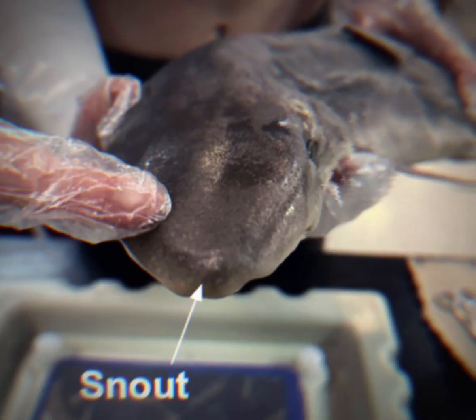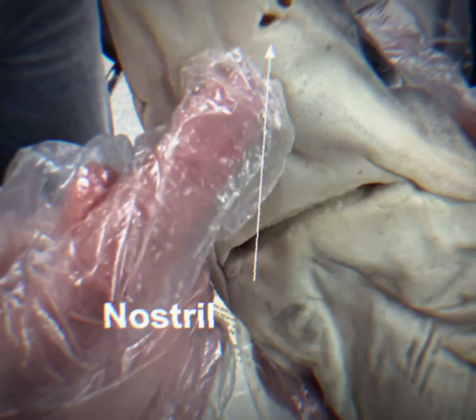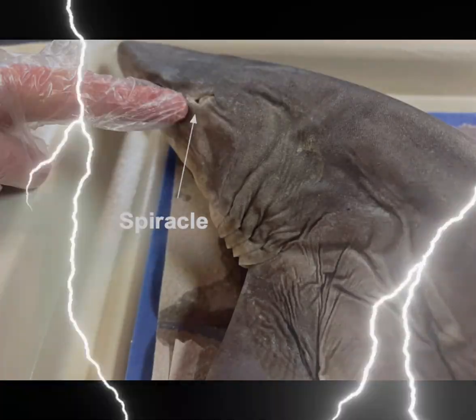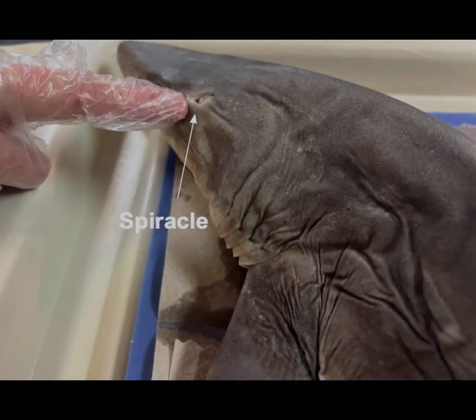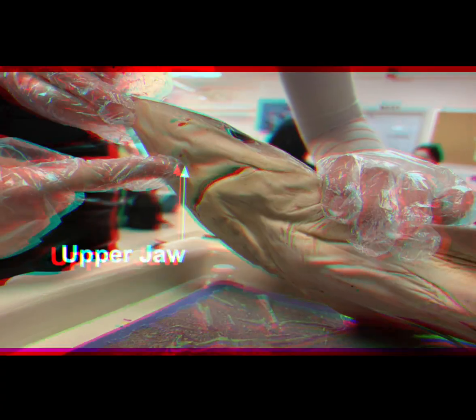Here's the snout of the shark. Here are the nostrils. They're located on the ventral side of the rostrum, anterior to the jaws. Water comes in and out through the incurrent and excurrent openings controlled by a nasal flap. Spiracles are located posterior and dorsal to the eyes. Water is taken in through these spiracles and goes into the mouth, where it leaves through the gill slits.